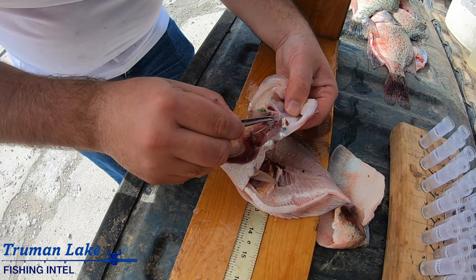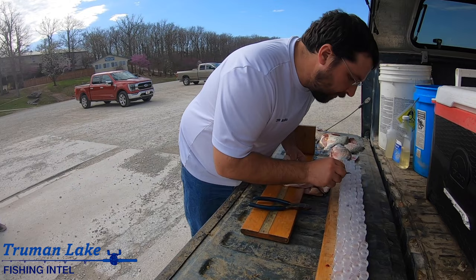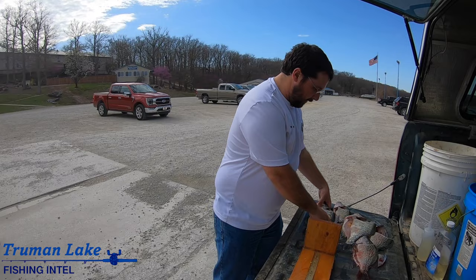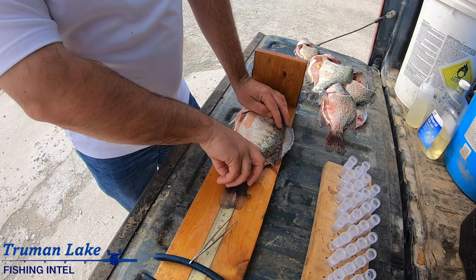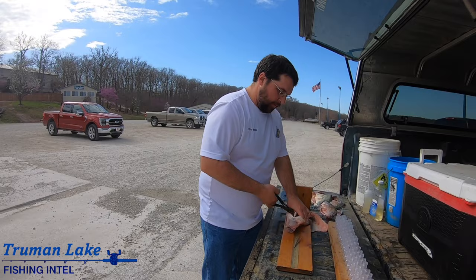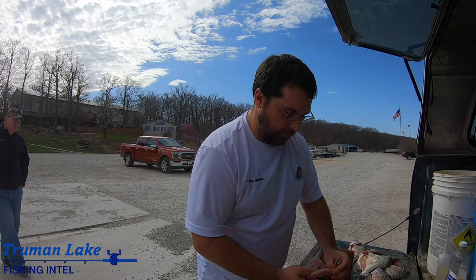Put them - number 25 - put them in a vial, move on to the next fish. Here's another white crappie, obviously a female - you can see all the eggs in there - thirteen five. Same thing: cut the gills, pull that apart at the back where the gills meet the back of the head, capsule's right there.